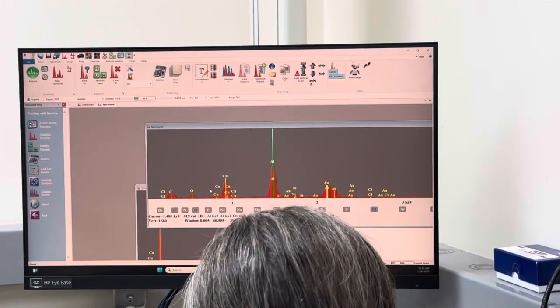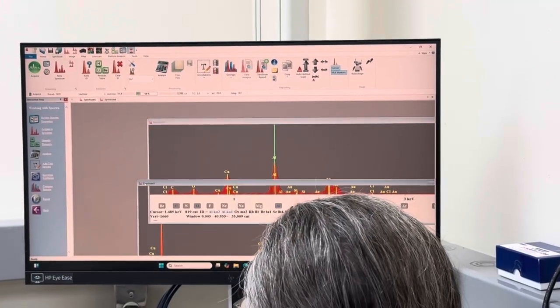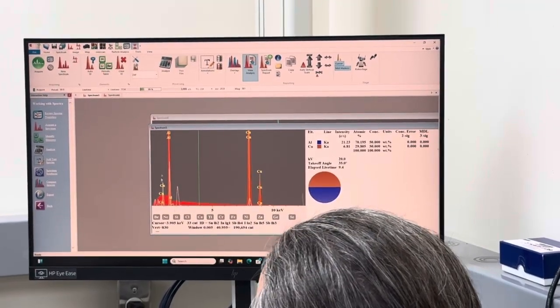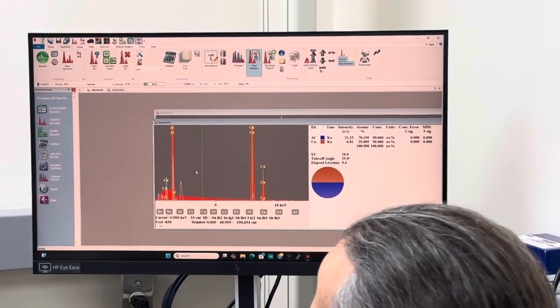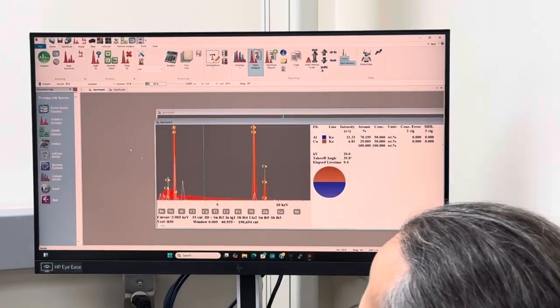Do this again. So the original spectra is here, and here's my simulated spectra. So I can't tell you the application, but it's there. It's in the quick flow chart, so that's why I'm just going over it.